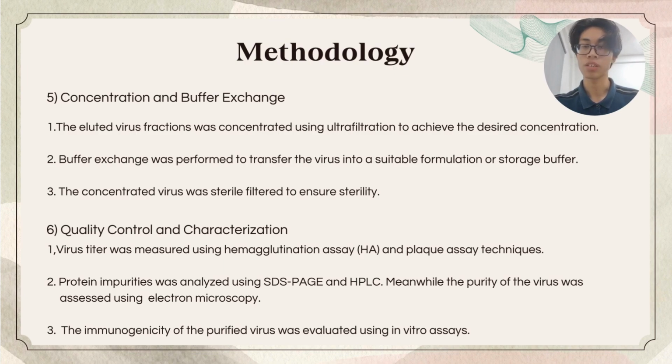The eluted virus fractions were concentrated using ultrafiltration to achieve the desired concentration. Following this, buffer exchange was performed to transfer the virus into a suitable formulation and storage buffer. The concentrated virus was then sterile filtered to ensure sterility.